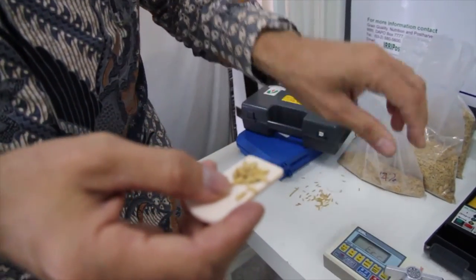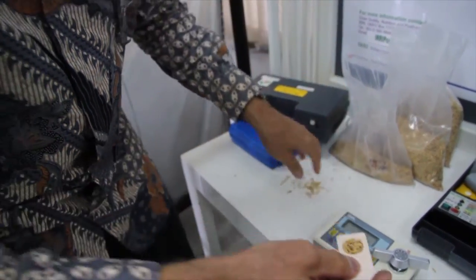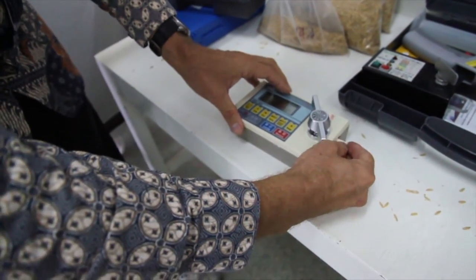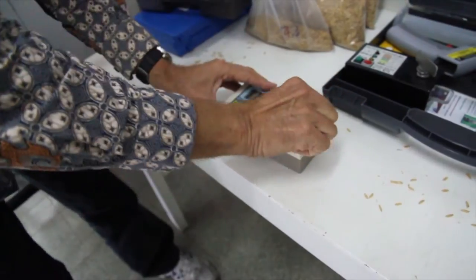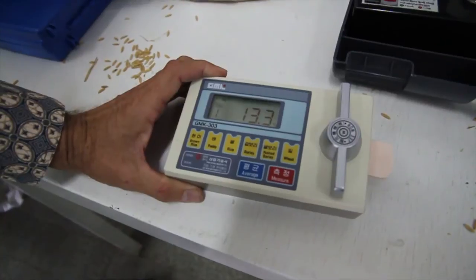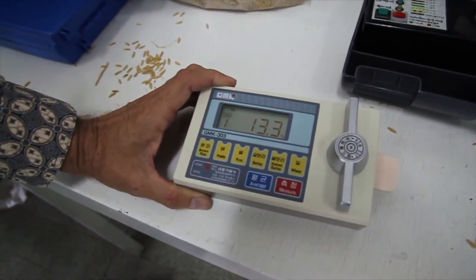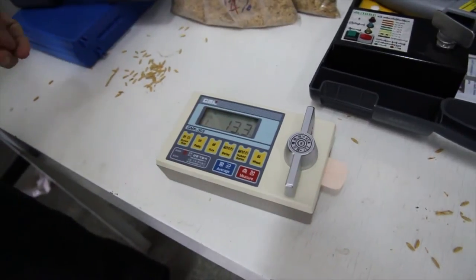To compare the ERI low-cost moisture meter with a commercial moisture meter, I use the same sample with 14% moisture content. The principle is the same — you use a couple of grains, put it inside the moisture tester, crush it, and measure. It gives us a reading of 13.3%, which is the same result as we had with the ERI moisture tester.